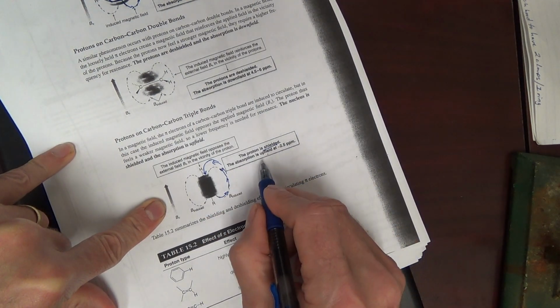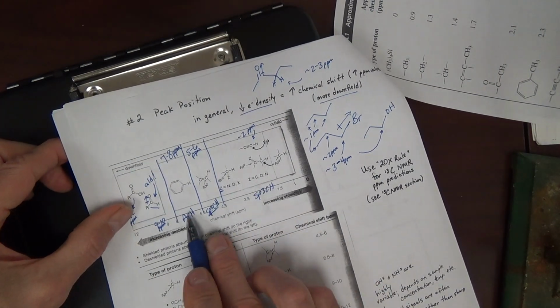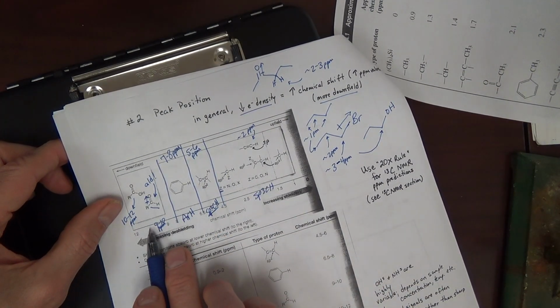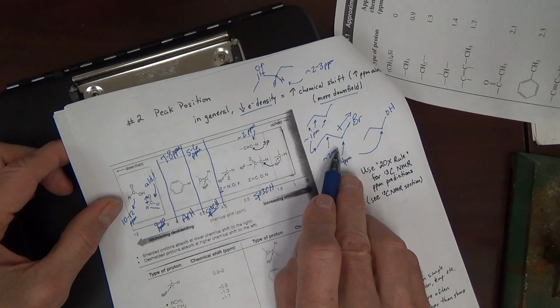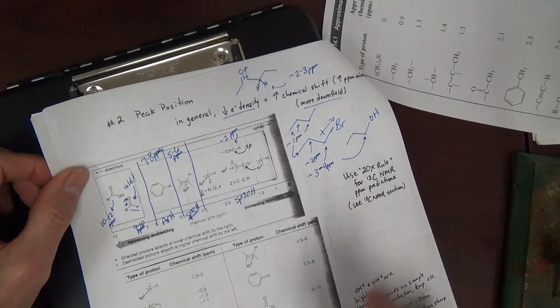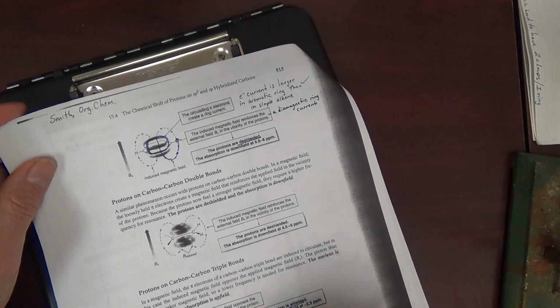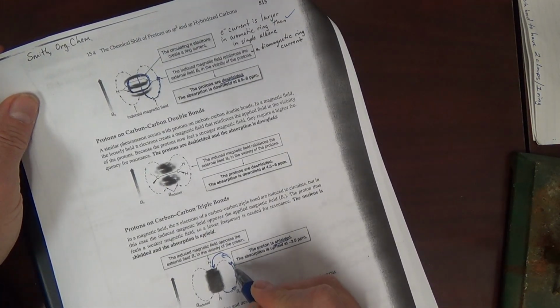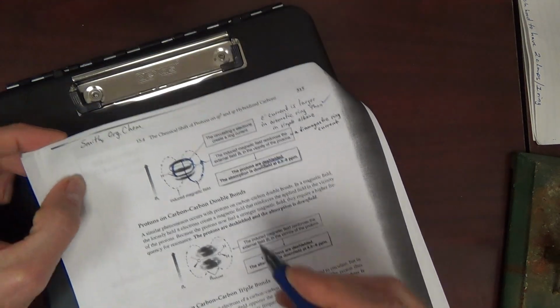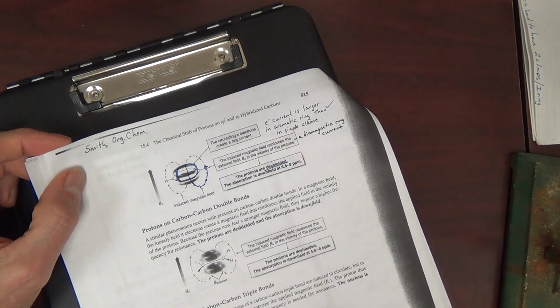Subtraction is the shielding, and shielding is going to move the signal to the right, and that's actually why the alkyne, instead of going sp3, sp2, and then maybe sp, actually the sp goes the other way and sits more upfield at about 2 to 2.5 ppm. This is all called anisotropic effects, meaning direction. It all depends on the direction of the field, okay, and where the proton sits. All right.